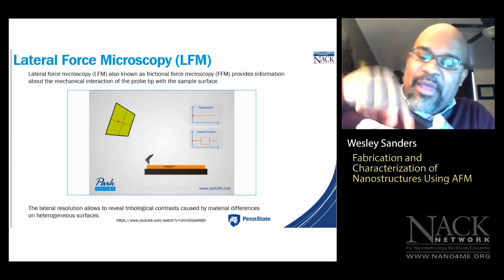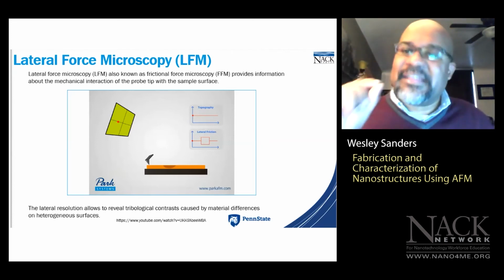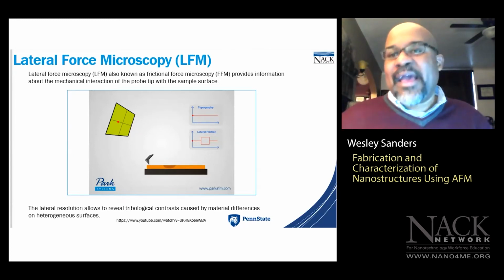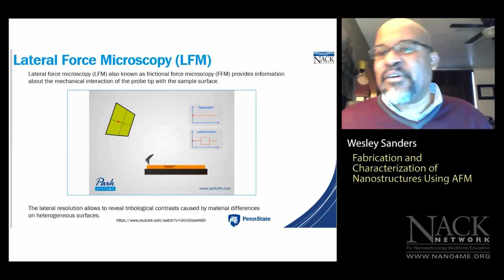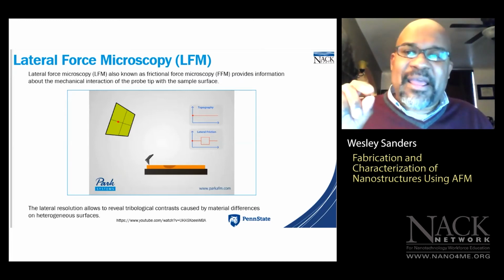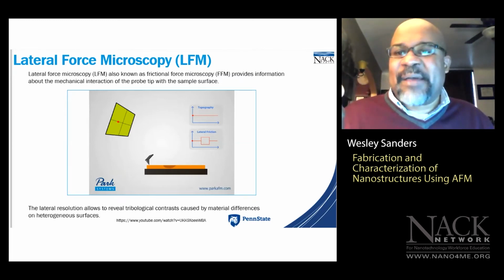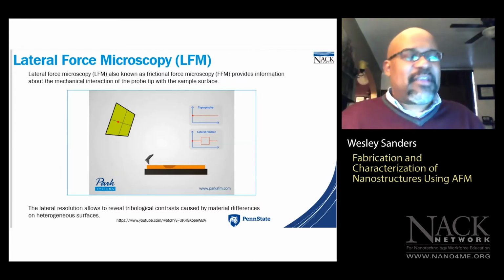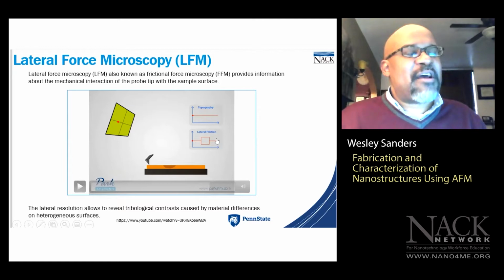By making direct contact with the sample surface, the tip is extremely sensitive to any variations in height across our substrate. Now, what happens if we have a thin molecular film like a self-assembled monolayer or a spin-coated polymer on a wafer where we don't see very many variations in sample height? In that particular case, you can use lateral force microscopy.